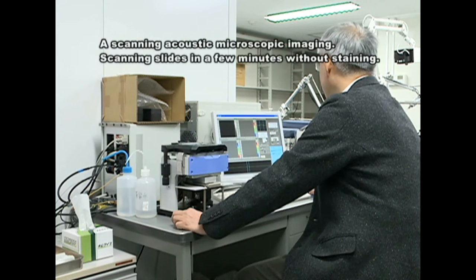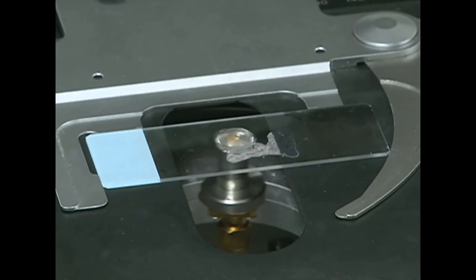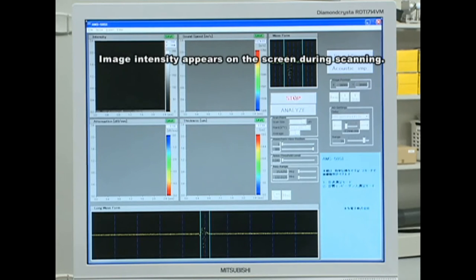This is the scene of the scanning slide. The slide is placed on the transducer upside down and scanned XY axis automatically. Flat sections in 10 micrometer thickness are necessary for scanning. It takes a few minutes to scan the whole area.